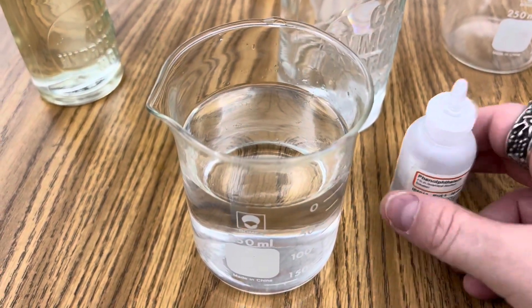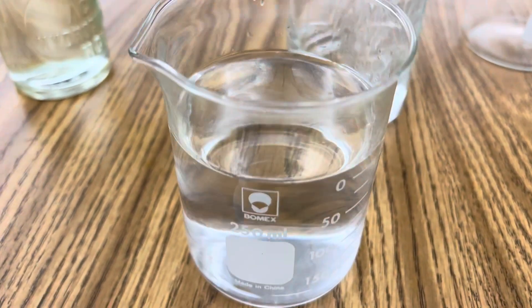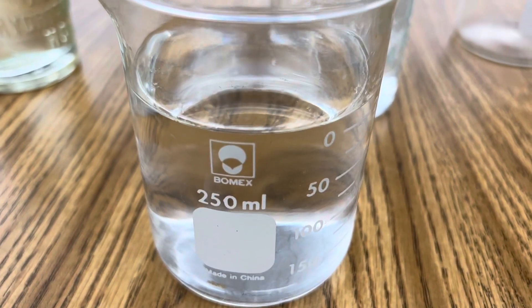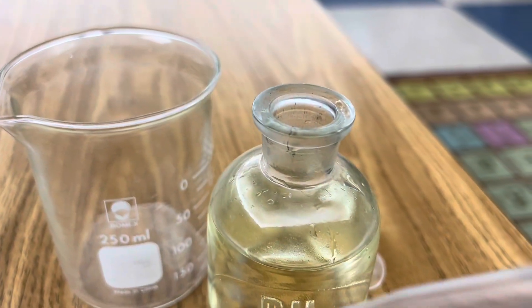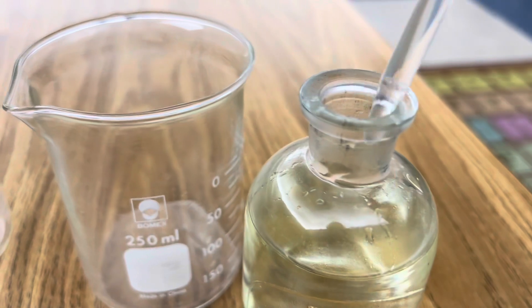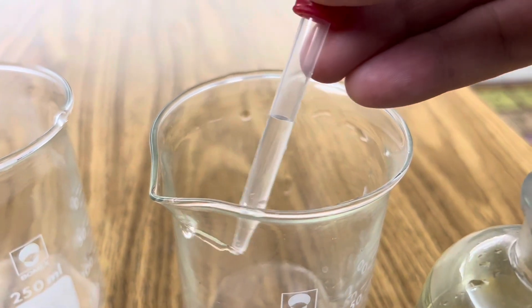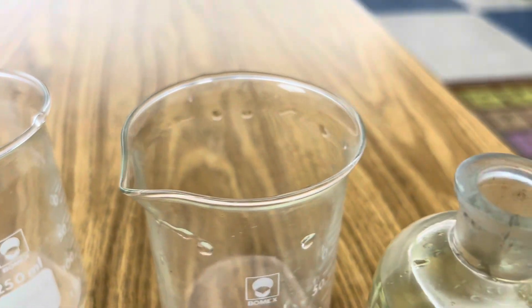To begin, add a couple drops of phenolphthalein to your distilled water. You'll notice that it's clear in the presence of water or acid. Next, take a dropper and very carefully coat the wall of one of your empty beakers with just a very small amount of hydrochloric acid.